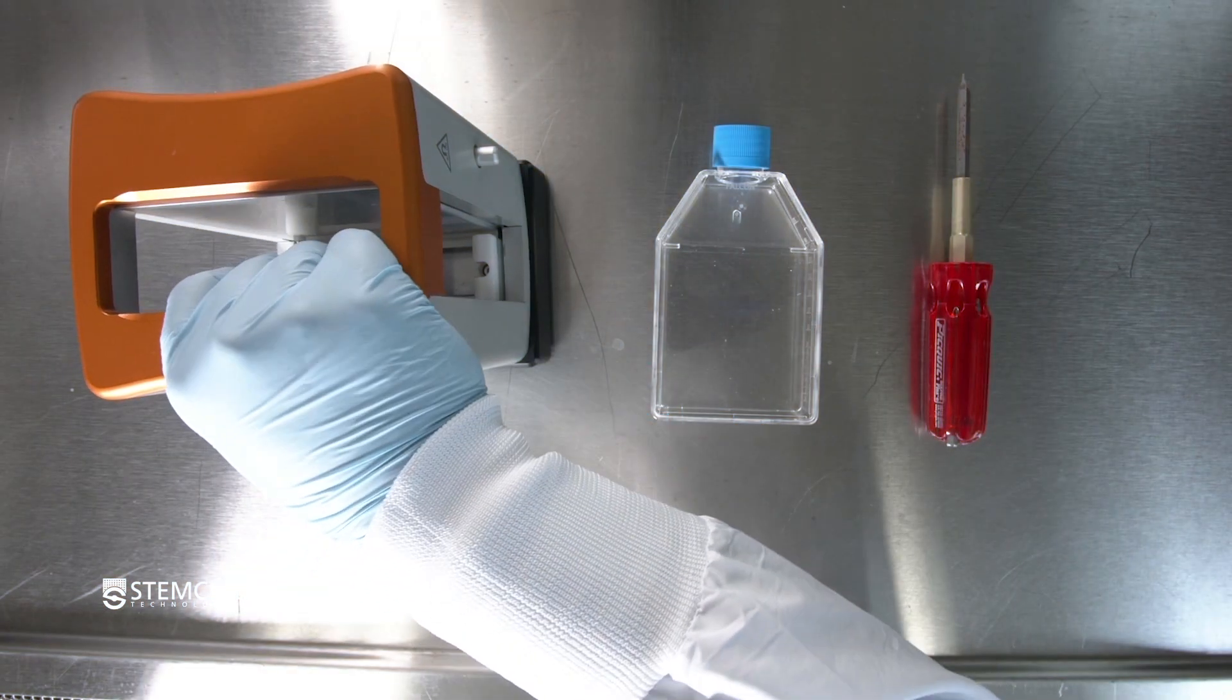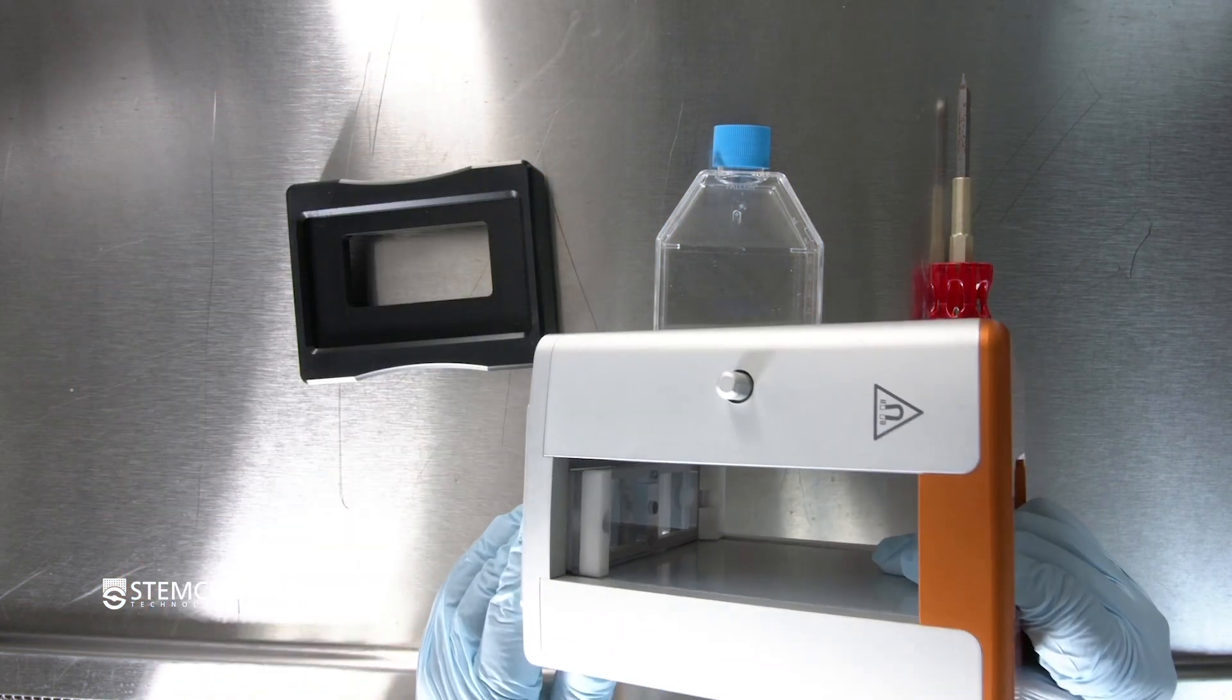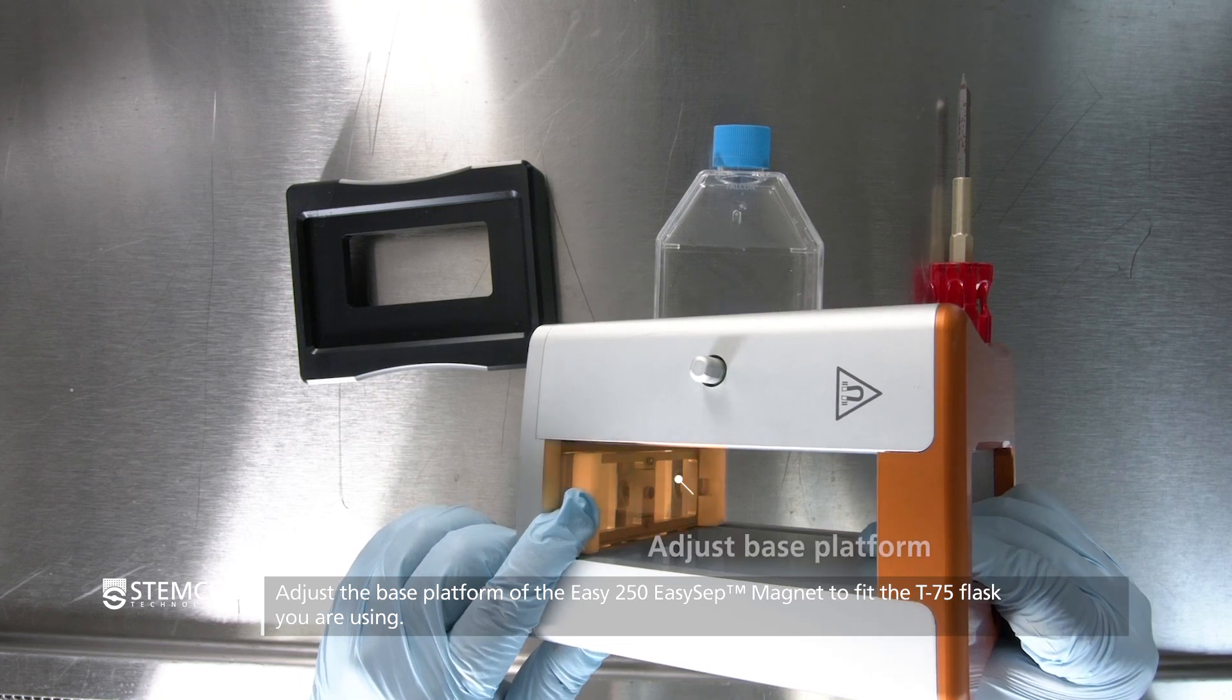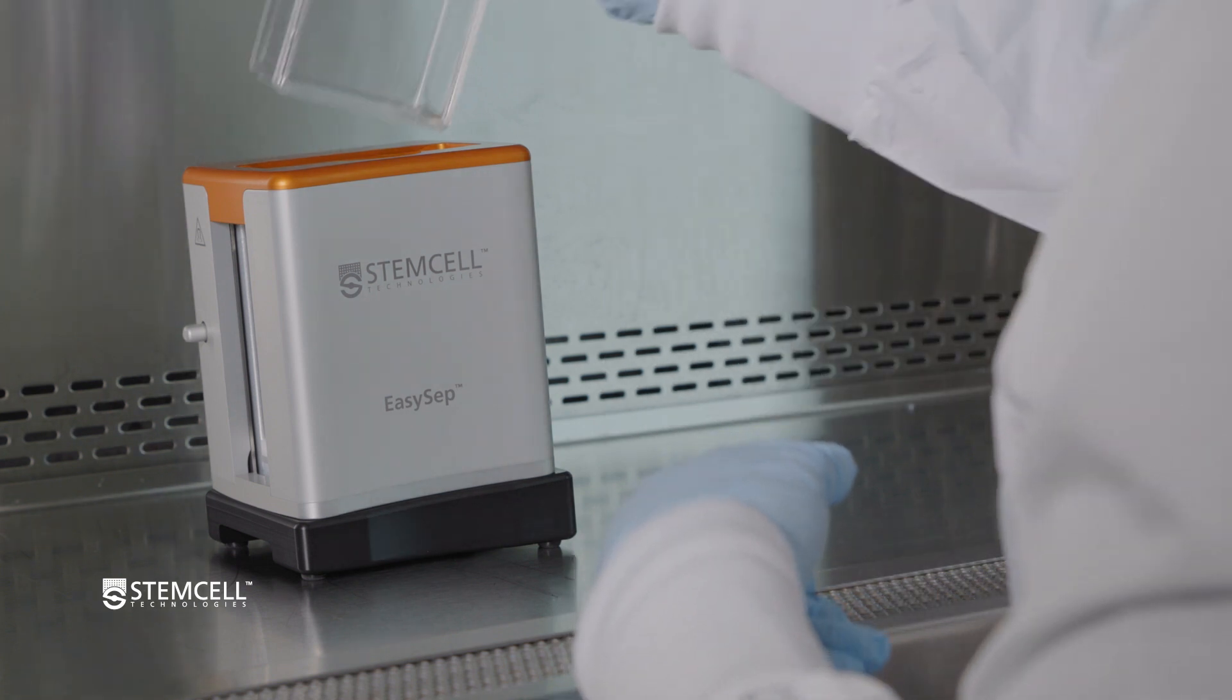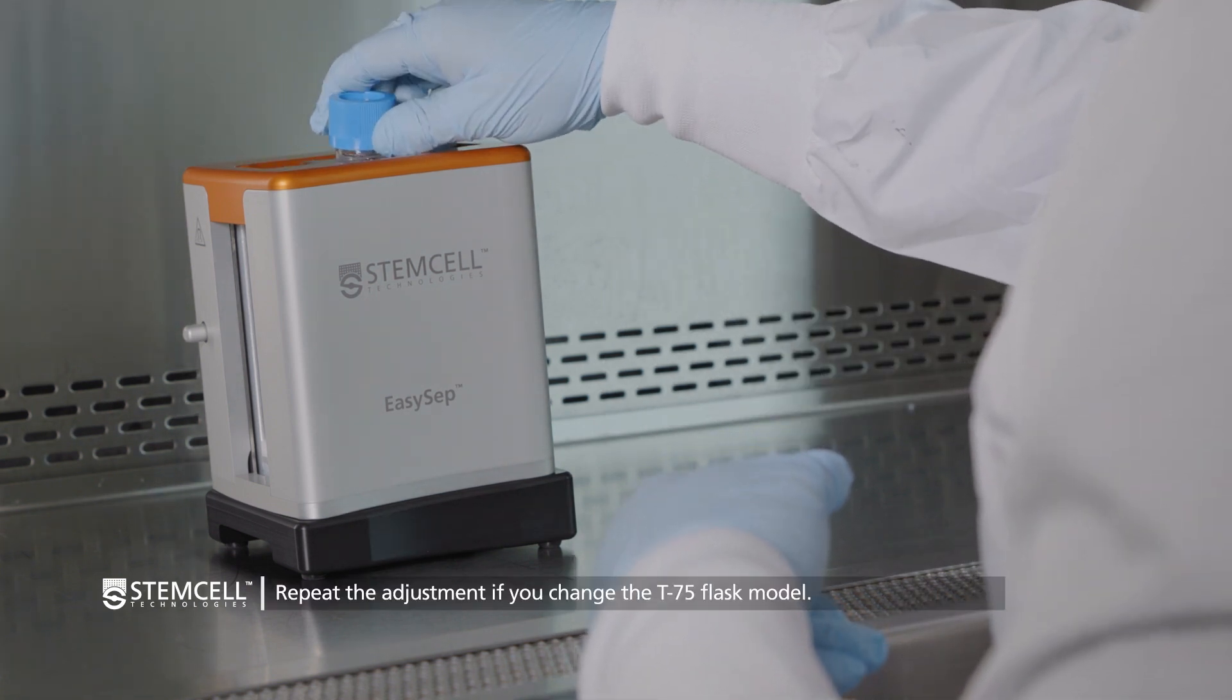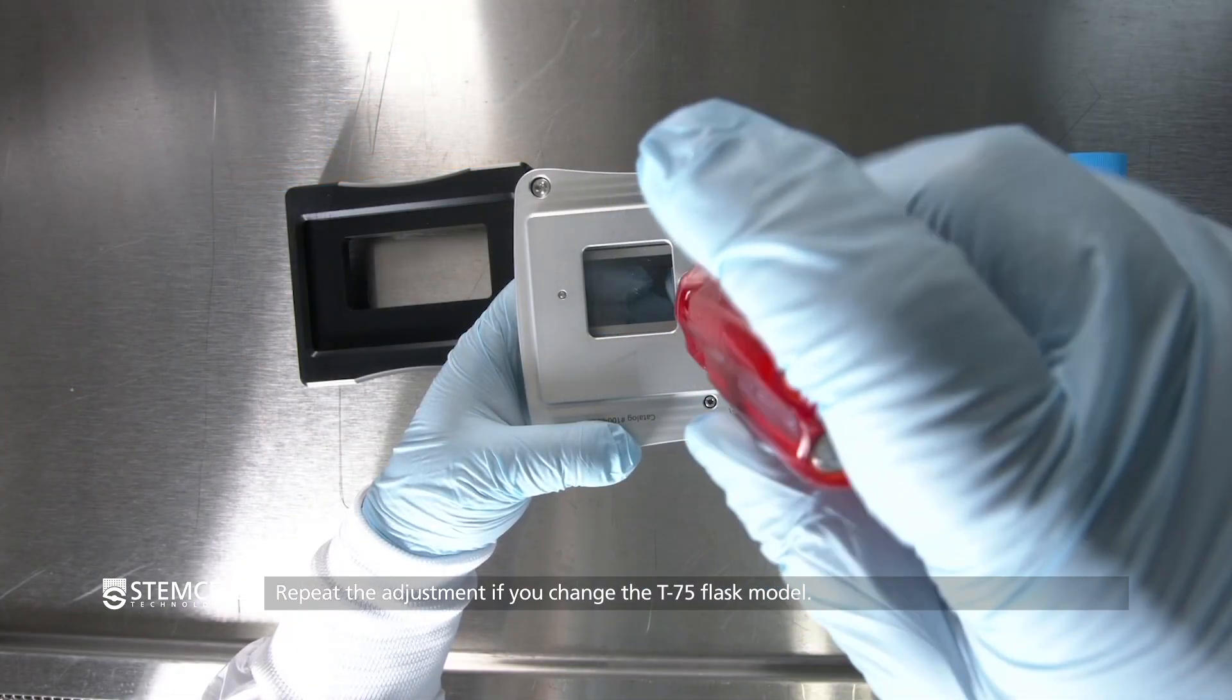If this is your first time using the EZ250 EZ-Set Magnet, you may have to adjust the base platform to fit the T75 flask you're using. This adjustment only has to be done once, but will need to be repeated if you change the T75 flask model.